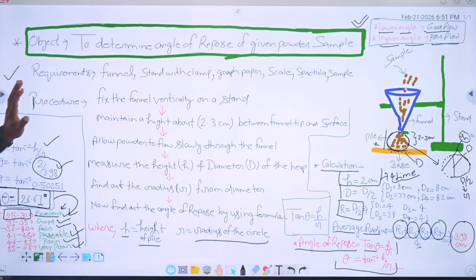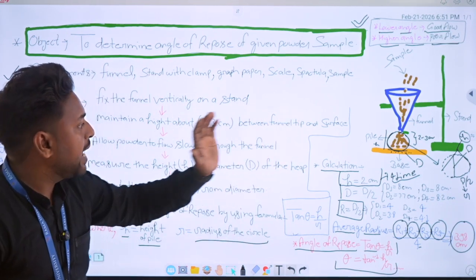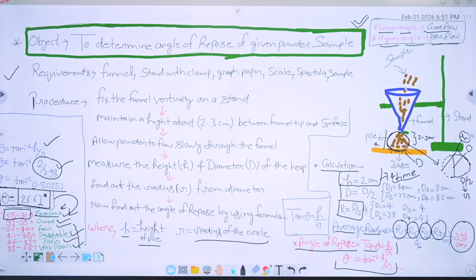So the whole practical is written in front of you with all the details: calculation, formula, diagram, step-by-step procedure, requirements, and each and every detail.